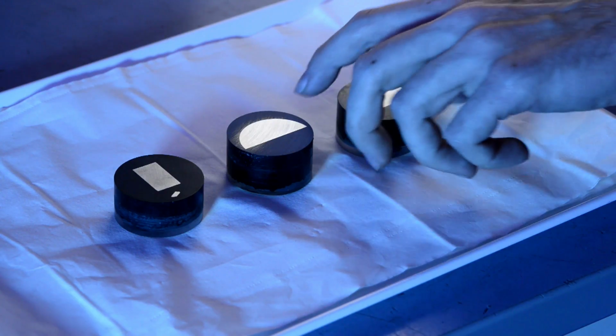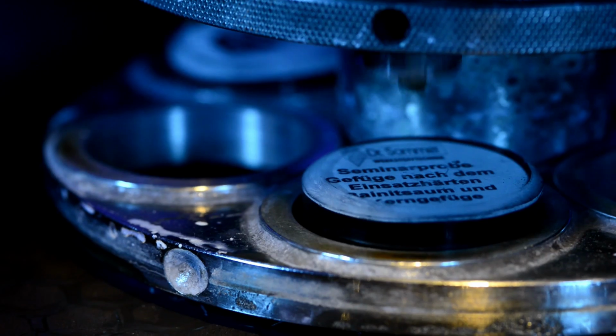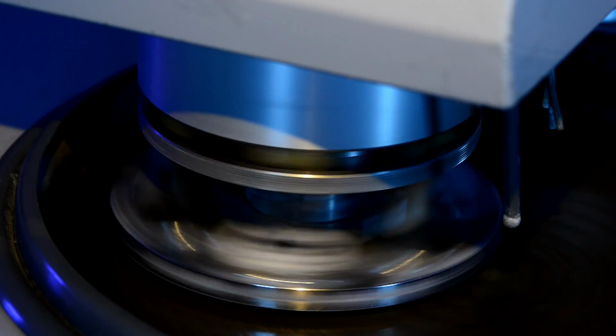Not only are damages assessed in the laboratory, analyzing materials for initial sample inspections are also a regular daily activity. An example from the wind power industry. If a new subcontractor wants to become part of the production of planetary gears, an initial sample inspection is necessary. This means that the customer will ask his subcontractor to create a corresponding component, and then this component will be tested thoroughly.